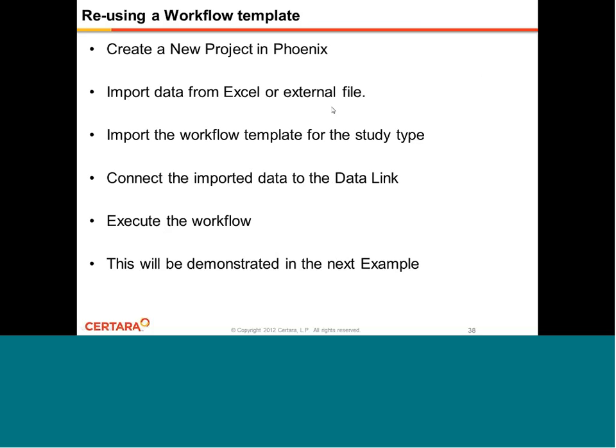Once a workflow template is created, to reuse it, do the following steps. Create a new project in Phoenix, import the data from the Excel or other external file type, then import the workflow template for the study type of interest, connect the imported data to the data link, and then execute the workflow. And this series of steps will be demonstrated in the next example.